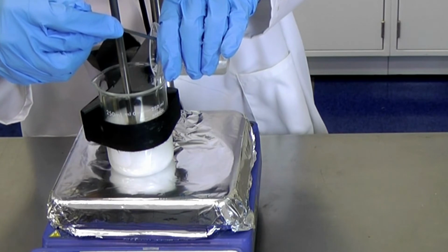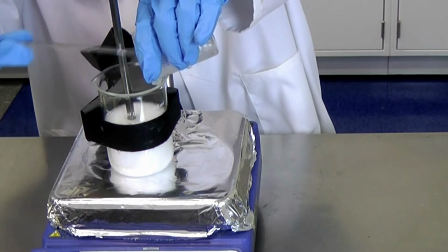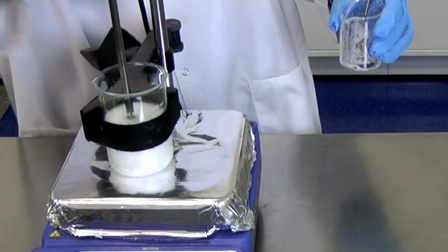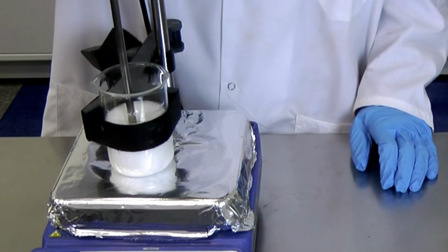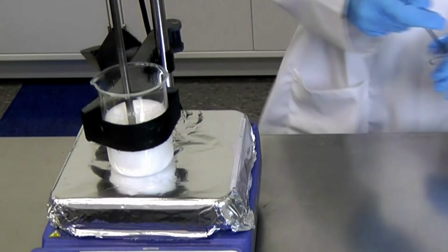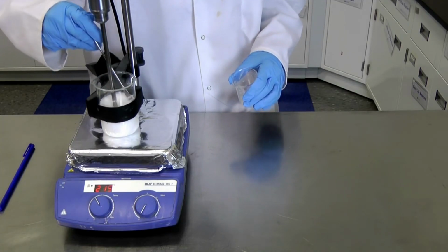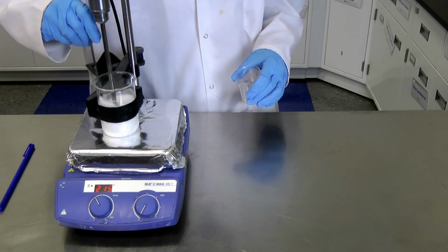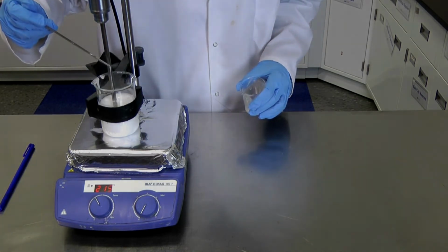As you can see, a nice white emulsion has been formed. You may wish to increase the speed of your propeller as the emulsion may become thicker. To ensure uniformity, continue propeller mixing for at least 15 minutes while maintaining temperature. Once it is mixed for 15 minutes, remove from heat and begin cooling while propeller mixing.